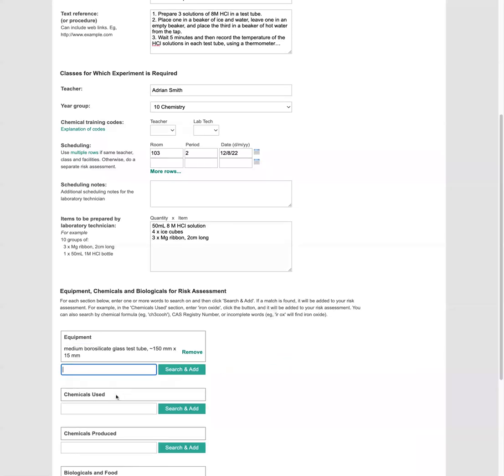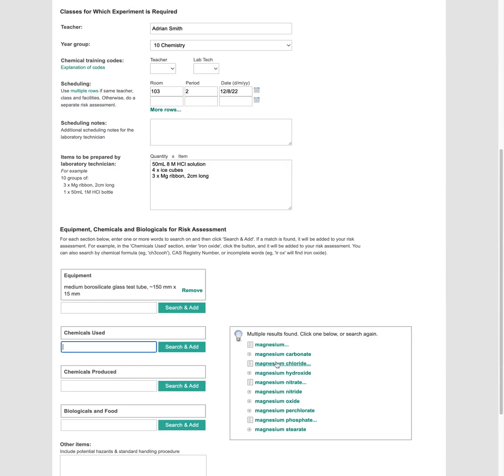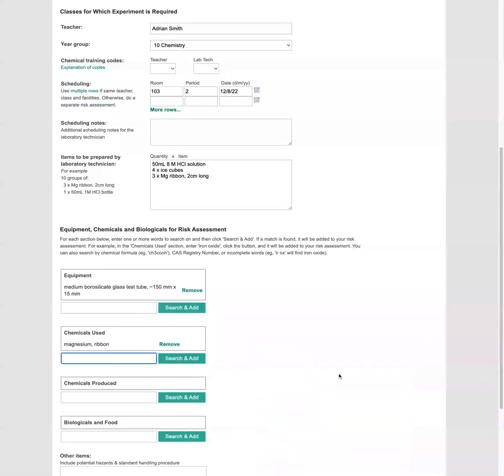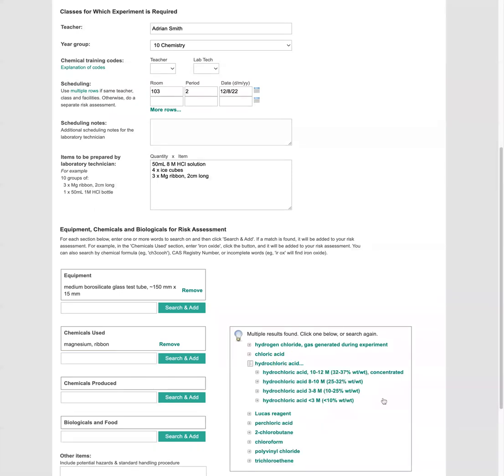We're going to put in the chemicals used. So for example, we need some magnesium. You can search on a partial name or full name. So here's magnesium and we want magnesium ribbon. Now we also want to have some hydrochloric acid. We can search on the formula too. So we use HCl. So hydrochloric acid, and we want eight to 10 molar.